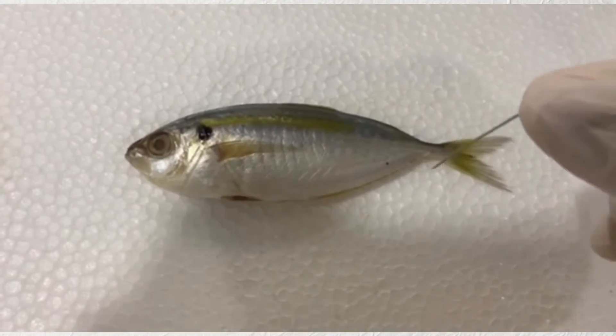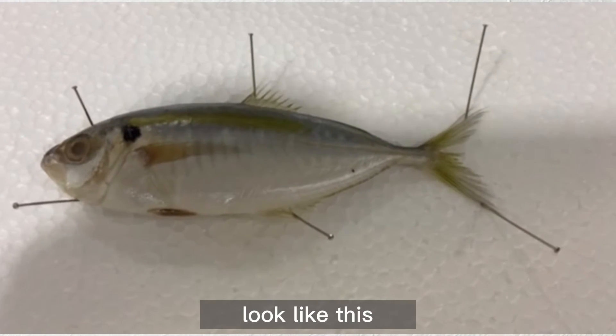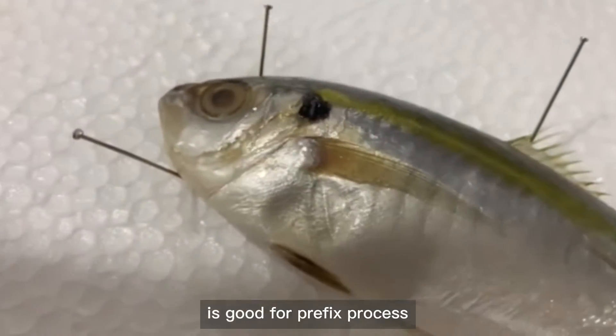Put your specimen on the styrofoam and pin it. Supposedly, it will look like this. And now the specimen is good for the prefix process.